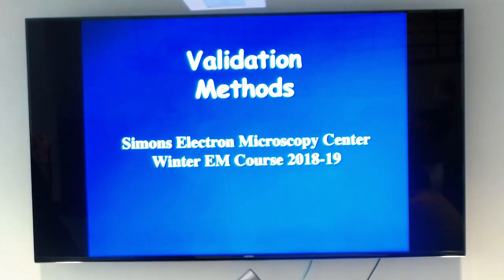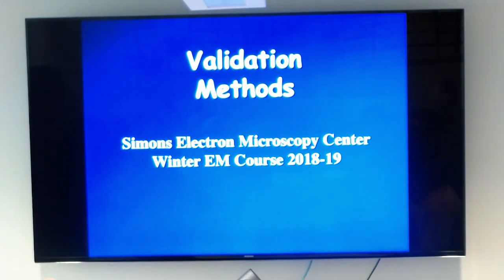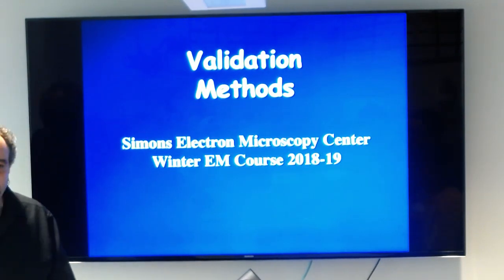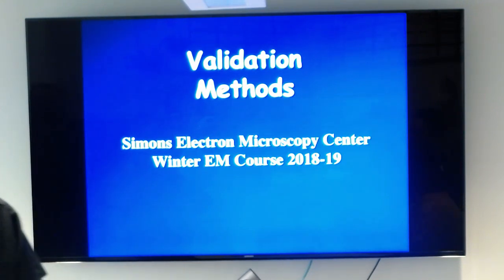So therefore, I'm going to talk a little bit about validation at the very end, because if I just talk about validation, it's done in 5 minutes. But I thought what might be interesting to you is to see how a different guy thinks about single particle electron microscopy. This is really because this is towards the end of this lecture course. Ask questions if you have any, as I come across these topics.